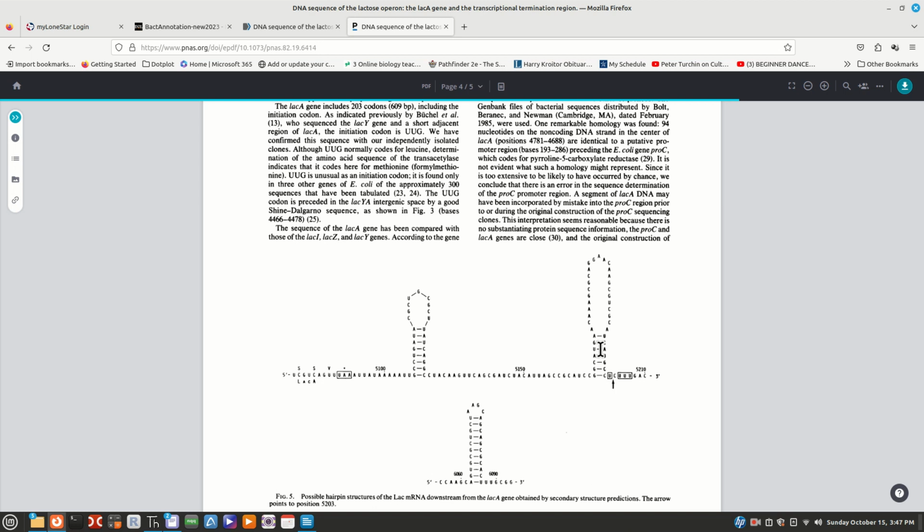And you know the regions it's going to come, especially in a bacteria. You normally, after the stop codon, you don't go too far. 200 bases maybe max after the stop codon. You're not going to go 1,000 base pair like in a eukaryote. You're going to go here, 50, 100, never more than 200 if I ever seen it. In fact, I don't think I've ever seen 200 for the terminator after the stop codon. So you don't have to go too far.